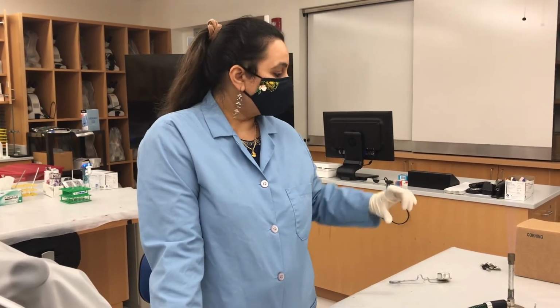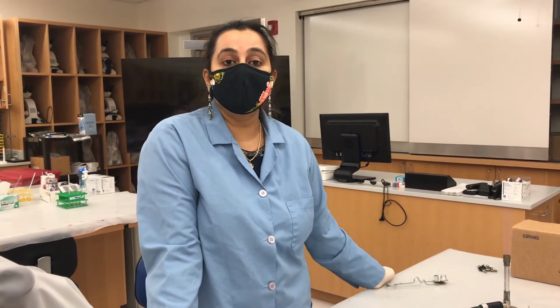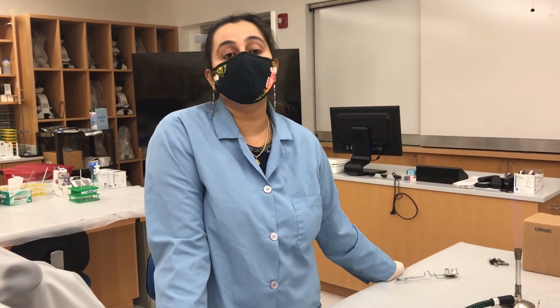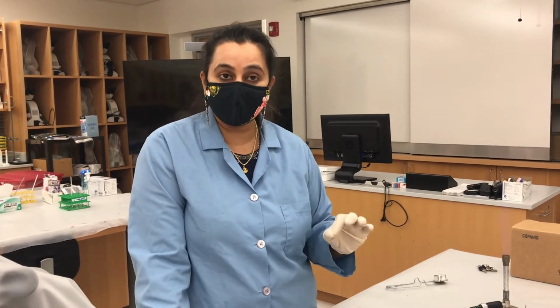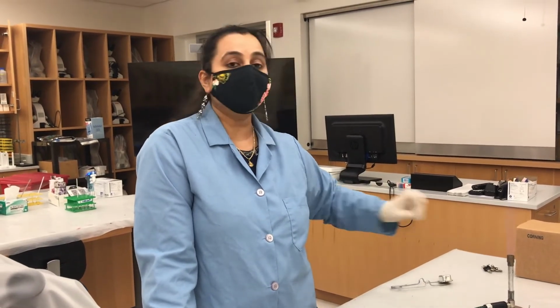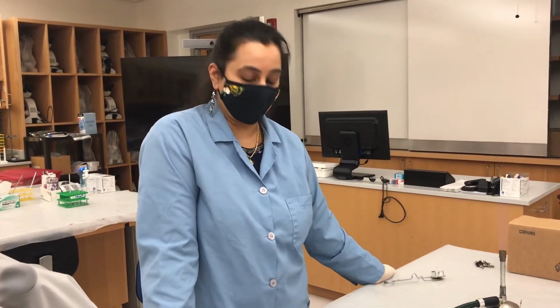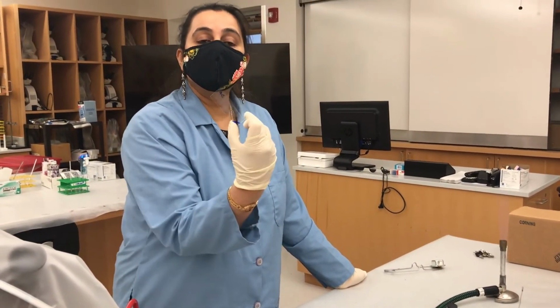What will happen if you run the slide many times for a long period of time? The bacterial cells would die, and the cells also would get distorted. They would change shape. So that is really not good for the gram staining technique. That is the reason whenever you're running through the flame, you have to be gentle, you have to be quick, and you have to flame enough. So you'll have to pass through the flame or the Bunsen burner 3 times without exposing the cells for a very, very long time. Alright, so my solid culture is ready, and you call it a bacterial smear.